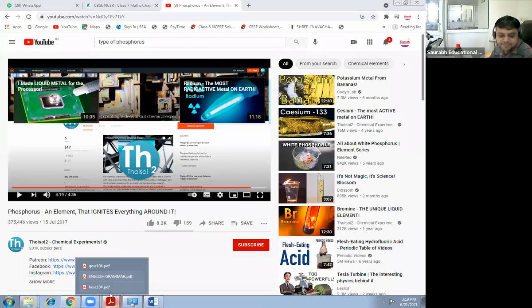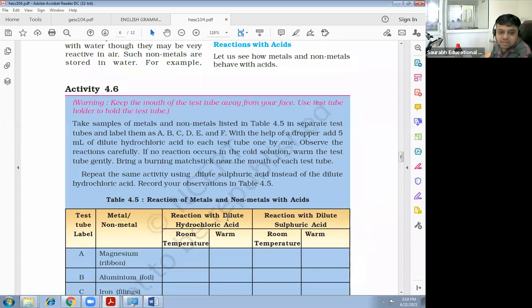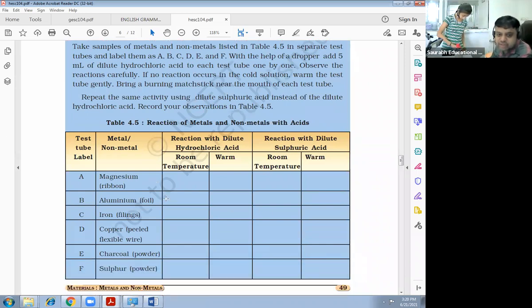Let's read further. Now reaction with acid. Let us see how metal and non-metal behave with acids. Take samples of metal and non-metal listed in Table 4.5 in separate test tubes and label them A, B, C, D, E, F. With the help of a dropper, add 5 ml of dilute hydrochloric acid to each test tube one by one and observe the reactions carefully. If no reaction occurs in the cold solution, warm the test tube gently. Bring a burning matchstick near the mouth of each test tube, right? And check out.